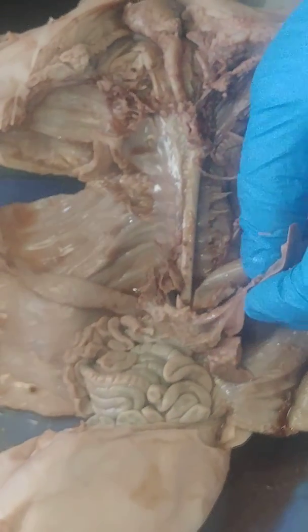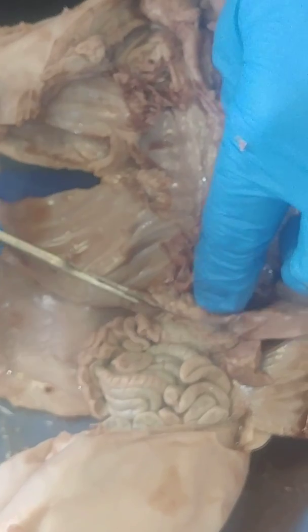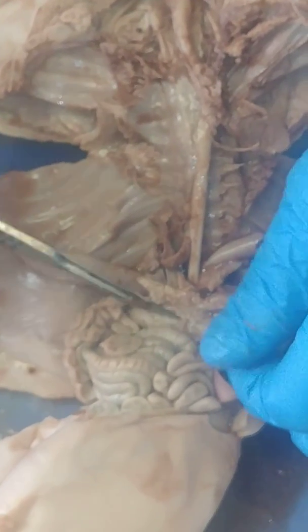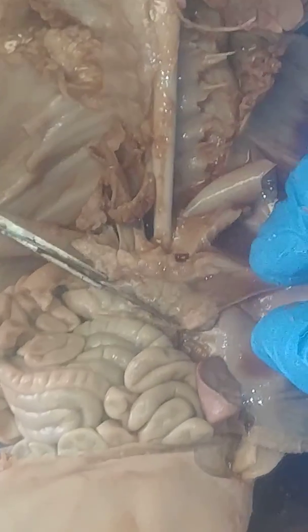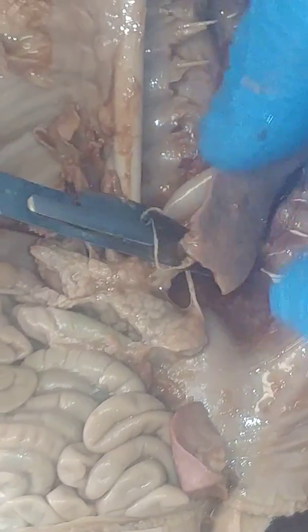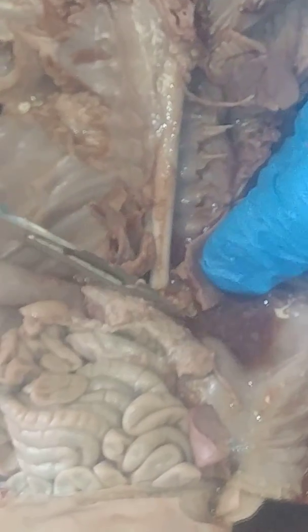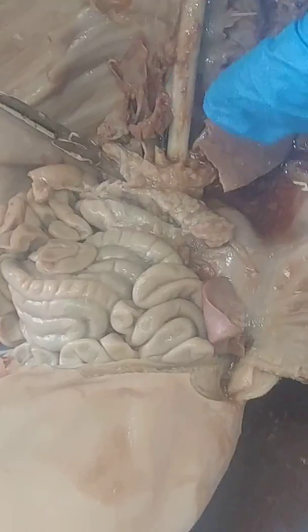So we work our way down, and this little globular organ right here that was located right underneath the stomach, if you see all these little bitty bumps, that's the pancreas. This is the thing that's making insulin and a whole bunch of different enzymes in the body. There you can go, you can see it now. Real clear.